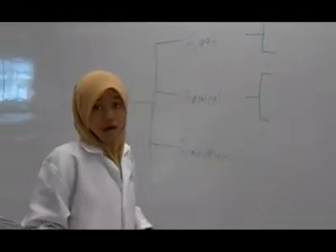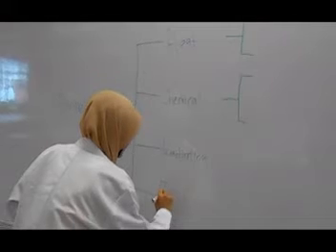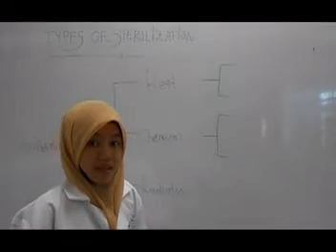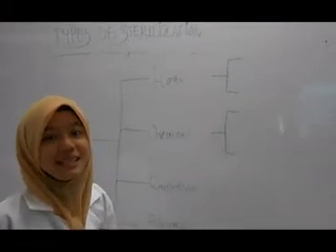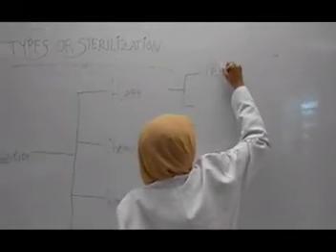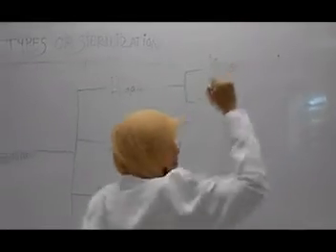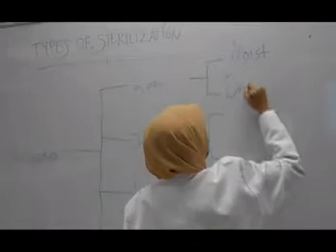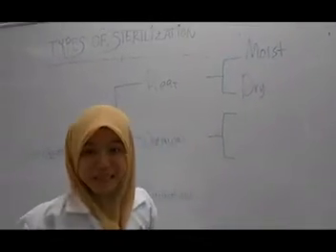And fourth, filtration. For heat sterilization can be divided into 2, which are moist heat sterilization and dry heat sterilization.